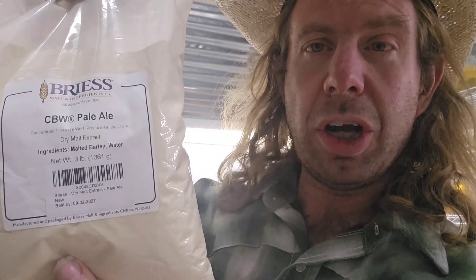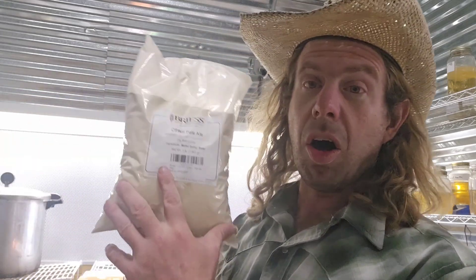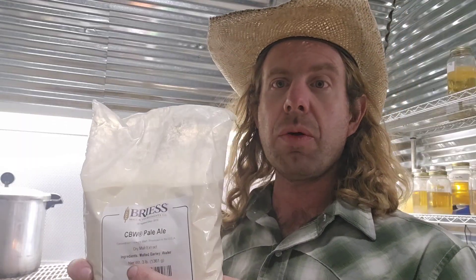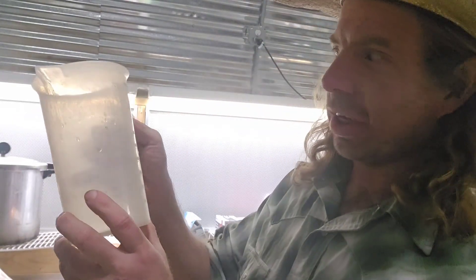Number eight: pale ale dry malt extract, or light malt extract. When I'm talking about malt extract for my petri dishes or my MEA — malt extract agar — this is what I use. I also like to put this in my liquid culture: I like one to two grams of this per 1000 milliliters of water in my liquid culture. Number eight: light malt extract.